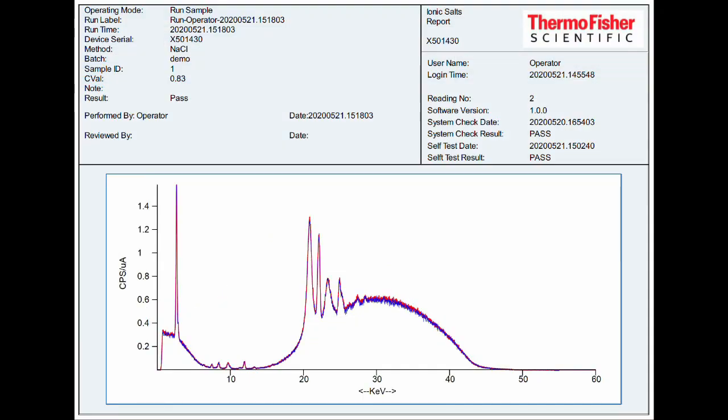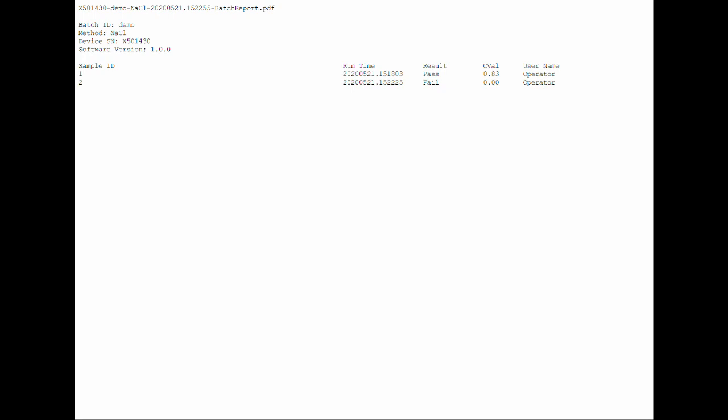Various reports will be found in the archive location. Here's an example of a sample run report PDF. On the report, you'll see the user who generated the data, a time-date stamp for when the run was generated, as well as the instrument's passing self-test results. Most importantly is the passing C value and the overall result of the sample run. A graphical overlay of the sample scan and method signature is displayed for visual inspection. Here's an example of a batch report in PDF format. The batch report is easily parsed by a LIMS or suitable data management system. A text version of the batch report is also available for use.